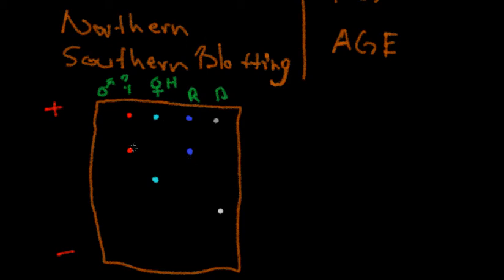Okay, so what we have here is, if we're comparing my hair and my student's hair, it tells me that my molecule of keratin is not as long or as big in terms of its aggregate size, for whatever reason. It doesn't tell me what that reason is, just the size. Or I can run a ladder of known keratin sizes in another column, and it'll be a mixture of materials.